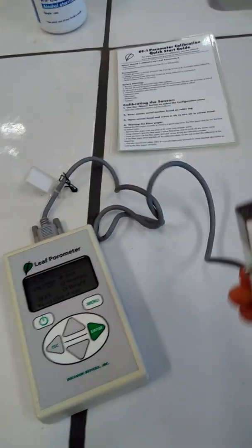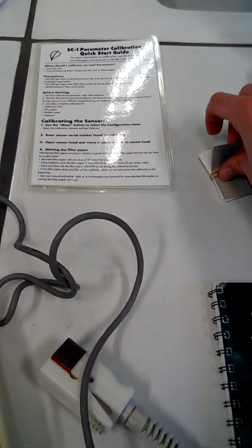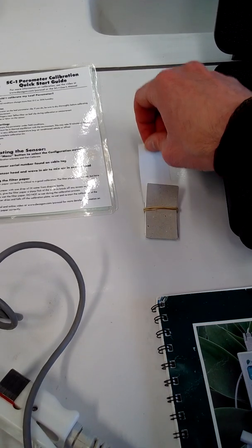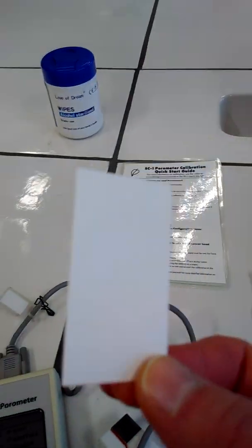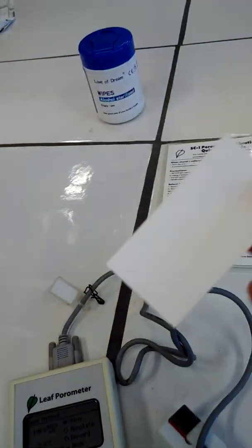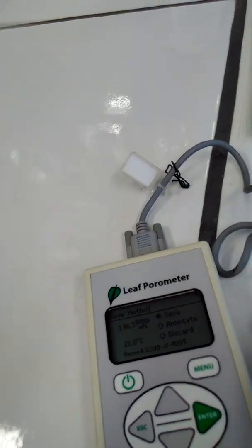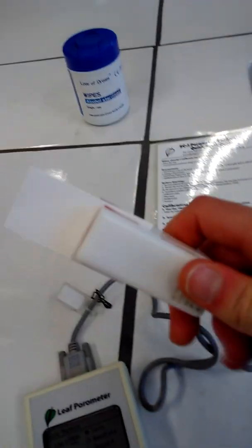All right. Now in your course notes you have a question, and one of the first ones is, I think, to measure a dry filter pad. Over here, these are filter pads. It's nothing more or less than a piece of paper. And it's to measure a dry filter pad. So that means I will put the device around that. Now you don't see me doing that because I have the camera in my other hand, but this is what I did.